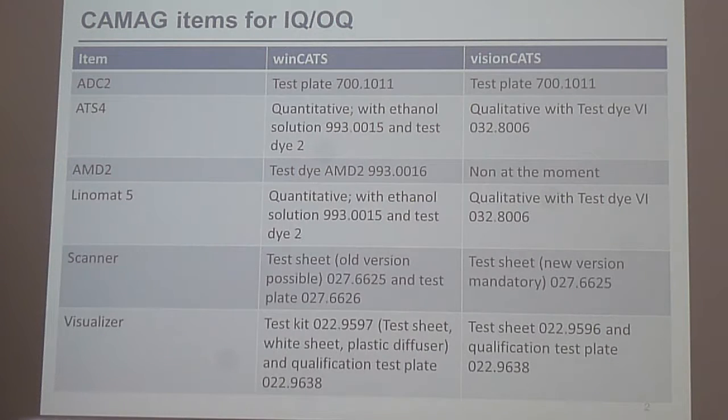The alignment, you have to be more accurate than with the other. That's just something of printing and so on. It should be okay. Mohamed had once that it did not pass. I don't know why, but for sure when you see that it has wrinkles or so, then you have to throw this paper away.